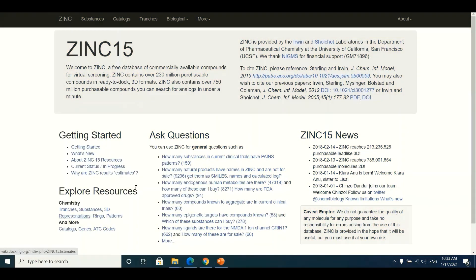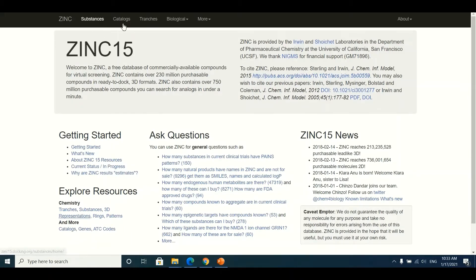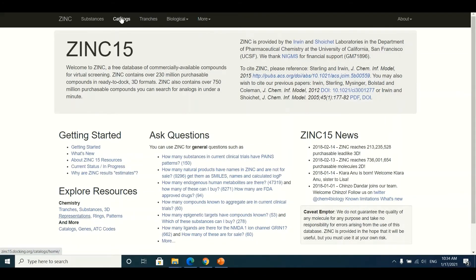This is the main interface of ZINC15. There are a number of things available here. At the top of the interface you can see some buttons including Substance, Catalog, Tranches, Biological, and More. In this tutorial we will focus on Substance and Biological.